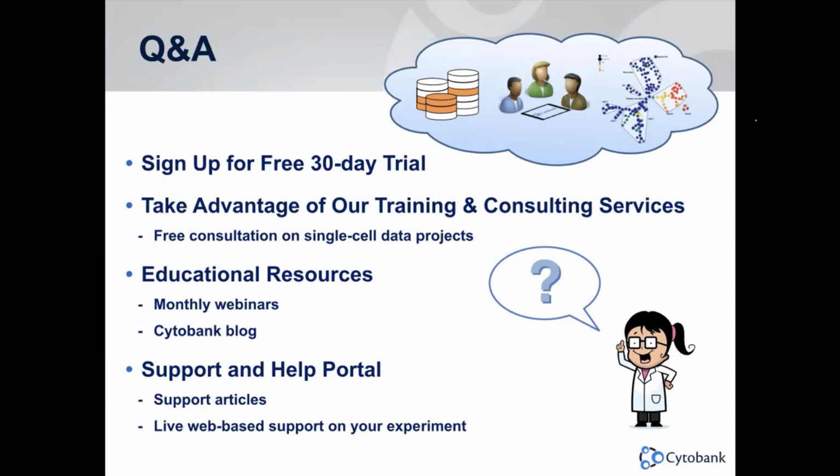Sure. So I have this data all loaded in Cytobank. I am happy to share the experiments with you if you just look me up and send me an email and tell me what your handle is in Cytobank. I'm happy to share the experiment that contains our data. Oh, that would be great.